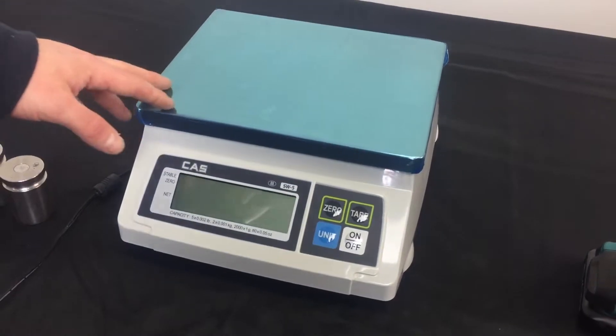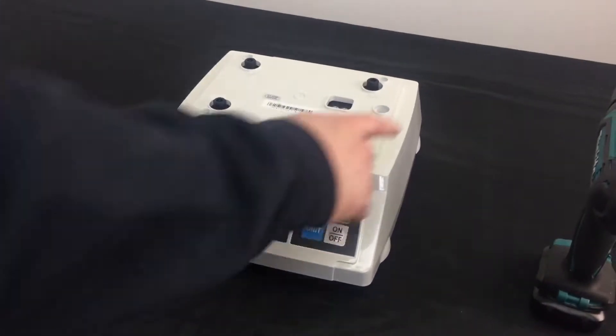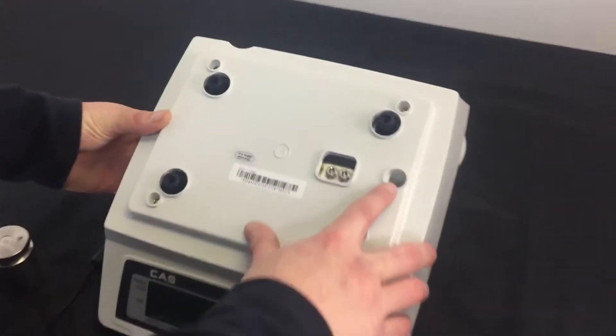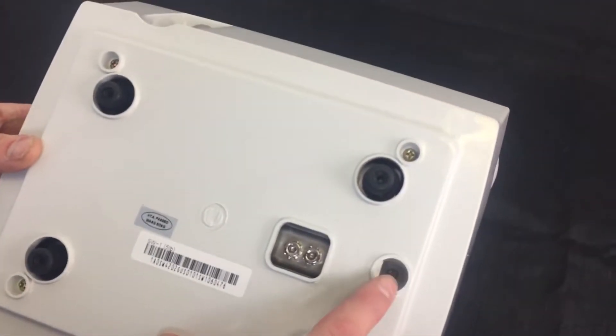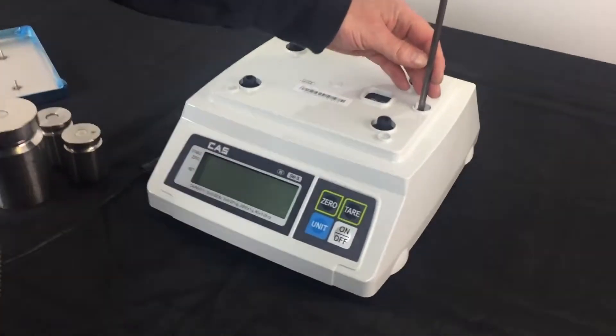Now, the first thing we're going to want to do is remove the platter on the top of the scale just so we can locate inside here in this port. Right here, there's a screw at the bottom. This is to remove the calibration plate, which is located underneath the scale.